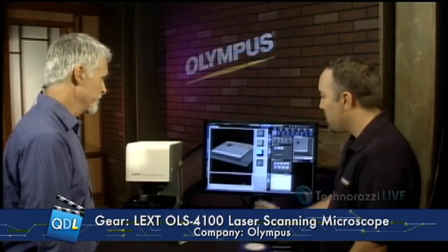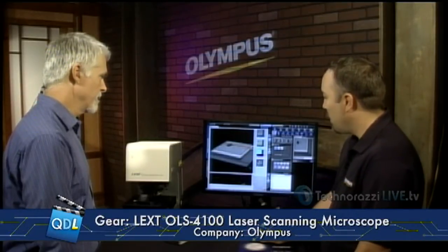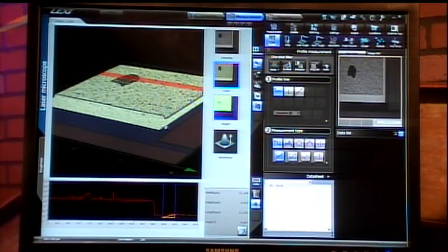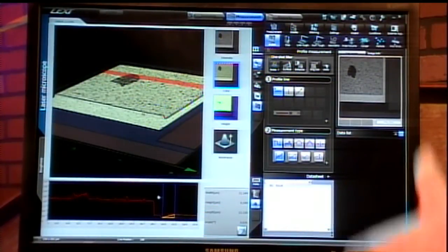So not only did it capture the three-dimensional height data, it captured the true laser image, and it also captured the true color image that we can overlay on top. This is our 3D image — we can zoom in and rotate around. And if you see this red line here, this is our line profile. Down at the bottom here we have our line profile for height data.